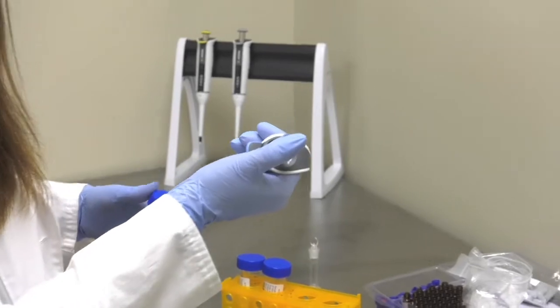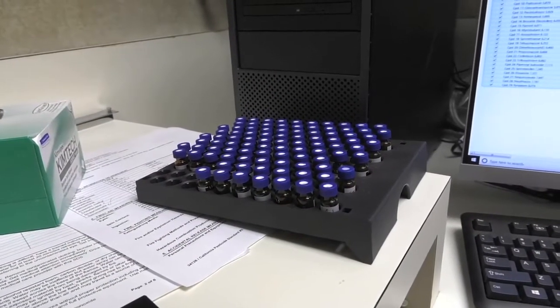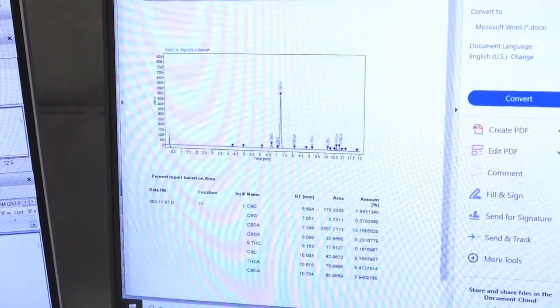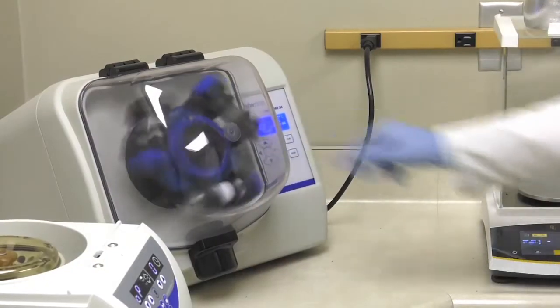Once the product is brought in, it's labeled and run through a series of tests that not only detect the THC levels, but also other residuals that could be harmful to the consumer. We bring it in, we dry the sample, we grind the sample, and we put it in some sort of solvent to extract the cannabinoids or the pesticides or whatever the analyte is that we're looking for. And then we run it into an analytical equipment.